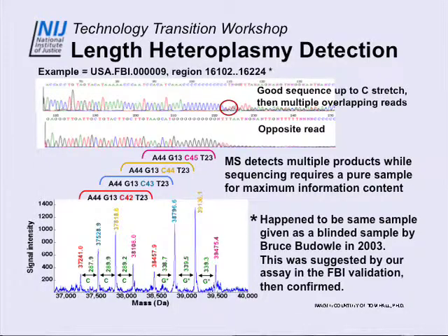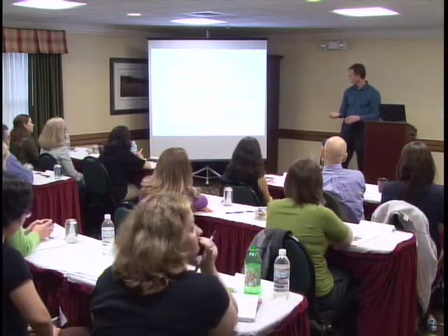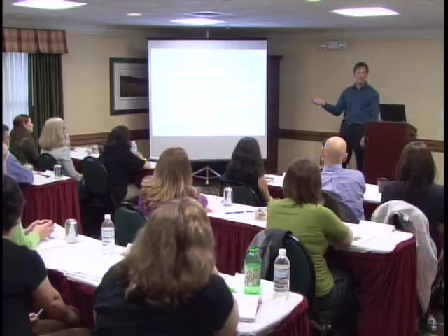You'll notice the distribution of these, although the balance isn't perfect between strands, that's just PCR, nothing's exact. But you see the same distribution pattern, you can quantify that. Moreover, as you go and amplify here to here, the presence of this length difference doesn't deteriorate your signal for the next primer pair. They're completely independent events. This happened to be a sample we had looked at a long time ago, and we didn't know what we were looking at at first. And then we measured it again, and we didn't know that it was the same sample until we correlated the profiles and saw, hey, you gave us that in 2003.